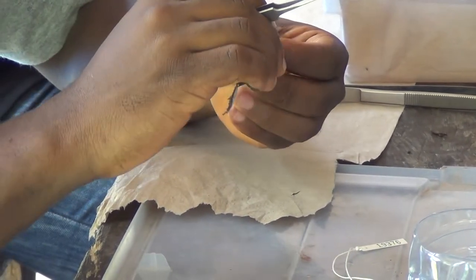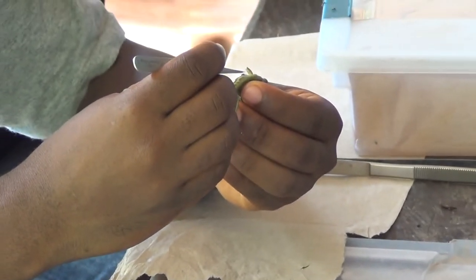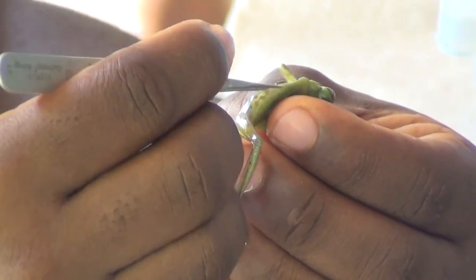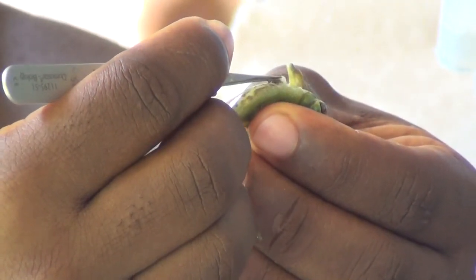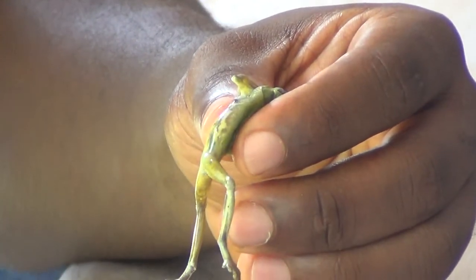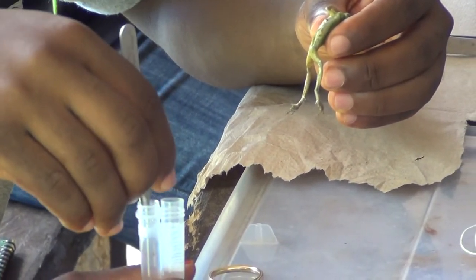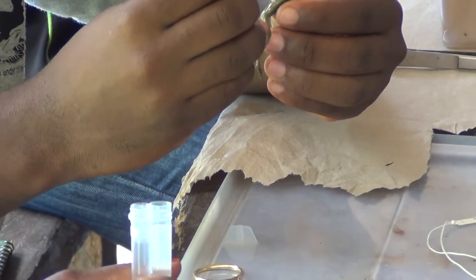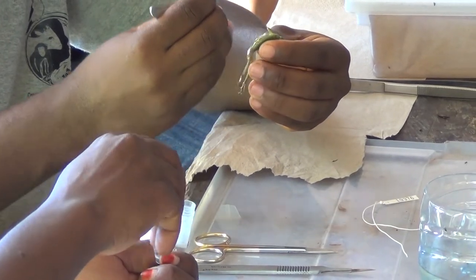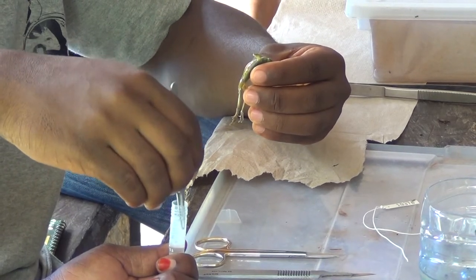Giro is making a small incision on the left side of its body, and through that incision giving it a little squeeze so a piece of its liver will come out. For most amphibian and reptile sampling we take a small piece of liver. We have a couple of different preservatives: one is ethanol and one is RNA later, which is just a salt buffer. One is good for DNA, and the other is good for both RNA and DNA.